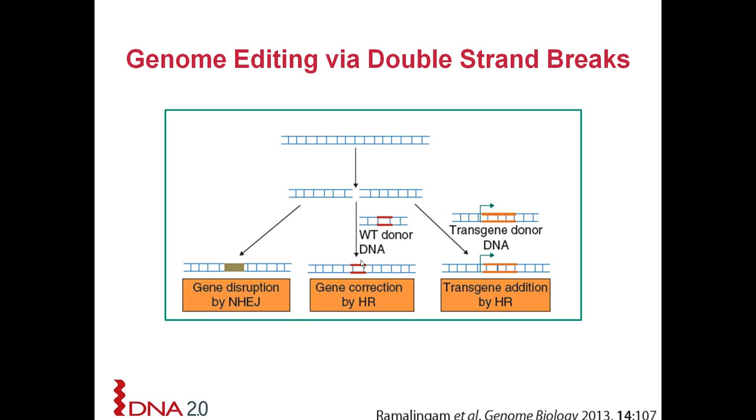Another way to fix a double-stranded break is by supplying a short oligo sequence. So in this example here, if you can put in a small oligo that bridges the site that was cut and introduces a small change like adding 3 base pairs or a different amino acid or putting a point mutation, things like that, this is a great way to do that.